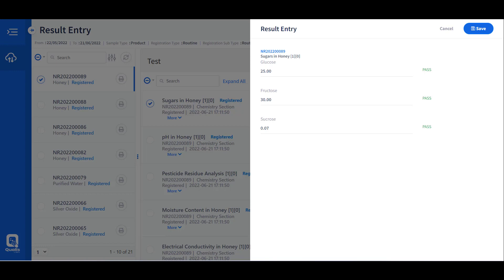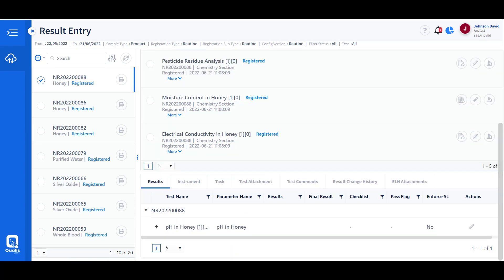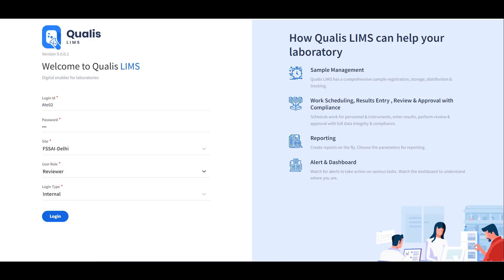Results are always presented as pass or fail based on validation against the specification values defined during specification creation. Once the results are captured and the user is satisfied, they mark the test as completed. The user can then add additional information such as tasks performed, instrument attachments, electronic lab notebook sheets, documentation, and comments, before passing the test to the next level for review and approval.